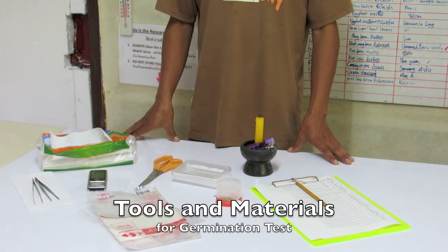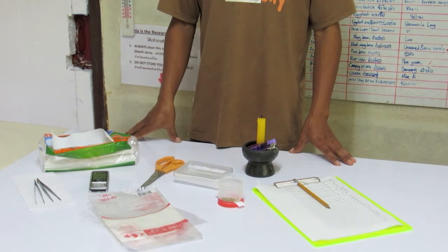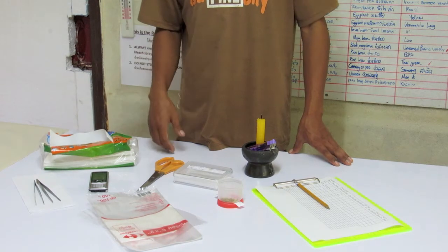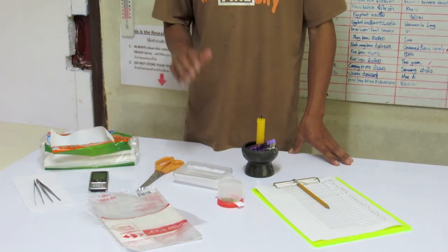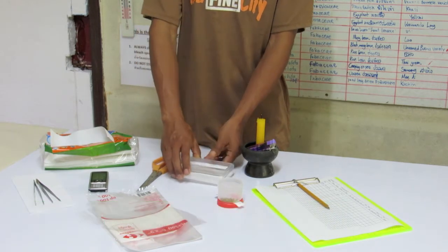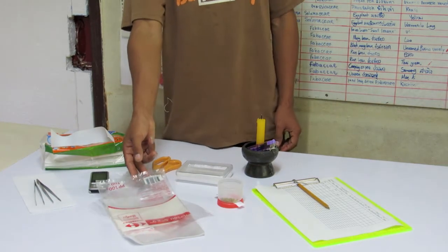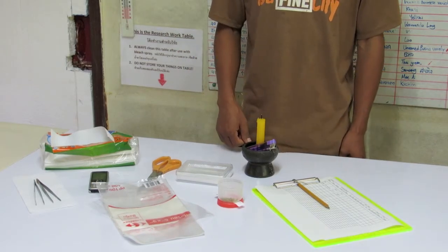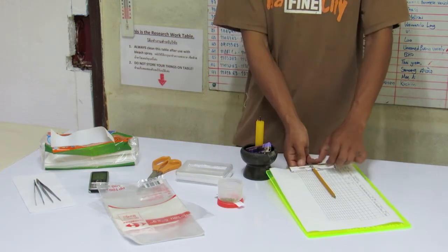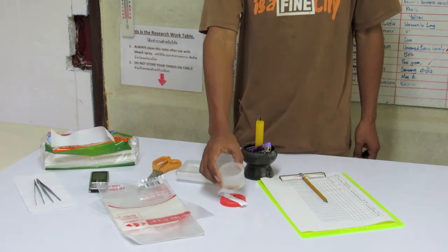Tools and materials for germination test: a clean workspace, well lit but away from an open window or fan; metal tweezers or forceps; a stopwatch or timer; scissors; clear plastic petri dishes with lids; small clear plastic bags approximately the size of the petri dishes; a candle; a simple table or spreadsheet for collecting germination data; seeds to be germinated; and a germination cabinet.